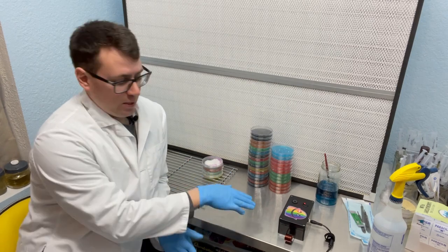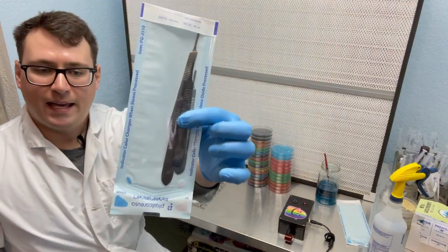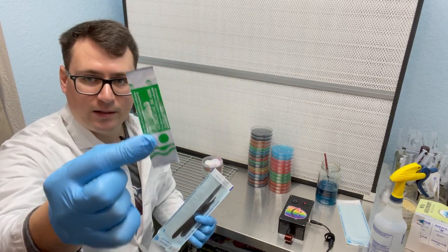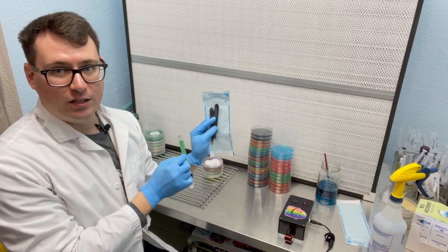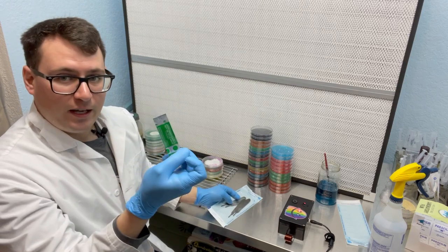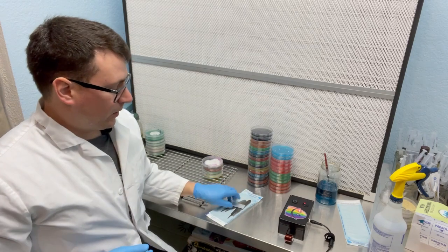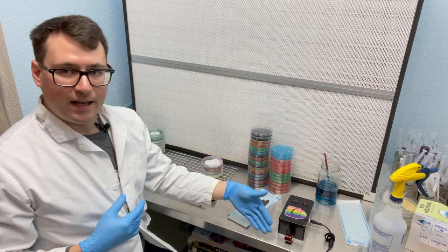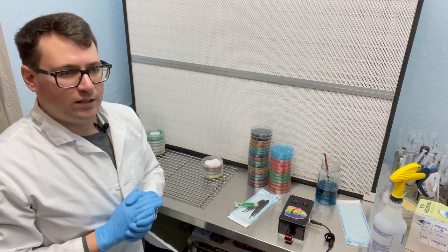Now, prior to using this, I have been sterilizing my blade handles in these little sterilization pouches, and then I use fresh blades for a lot of things. I still think there are a lot of applications I will use this for, just because I really like using fresh sharp blades for cloning mushrooms, for example, over a blade that has been sterilized by heat over and over again. They lose their sharpness after a certain point.